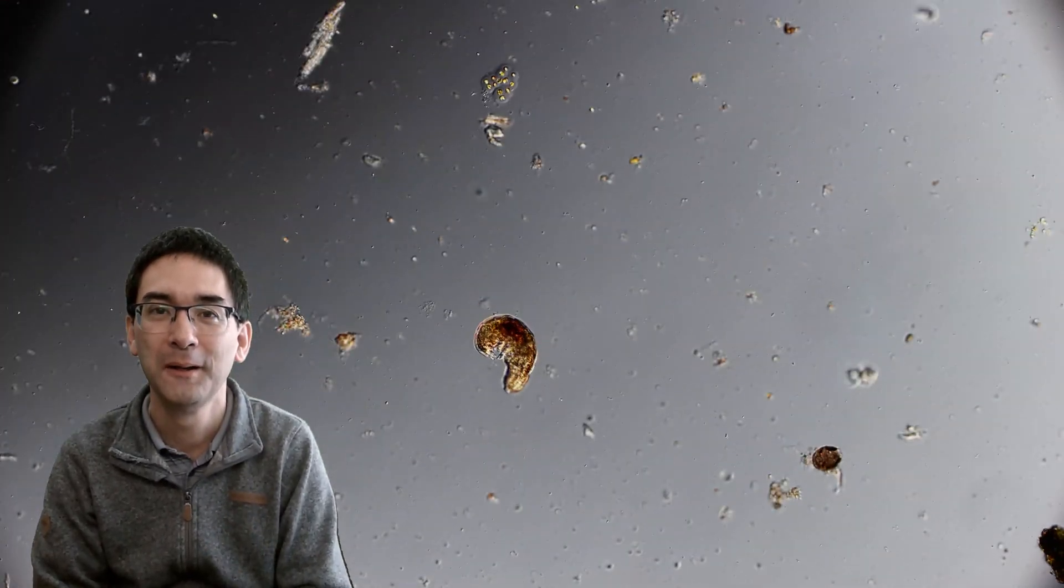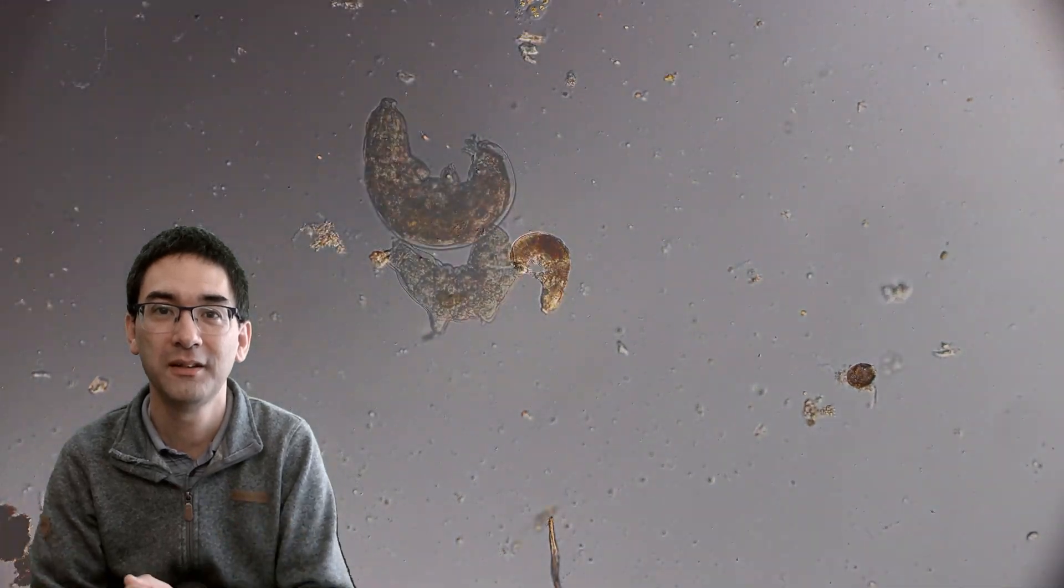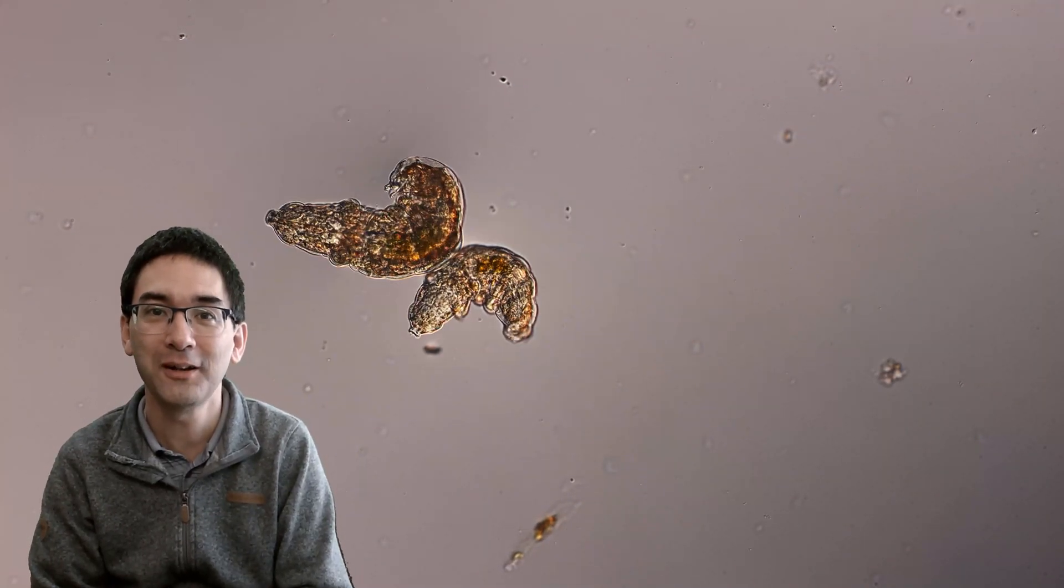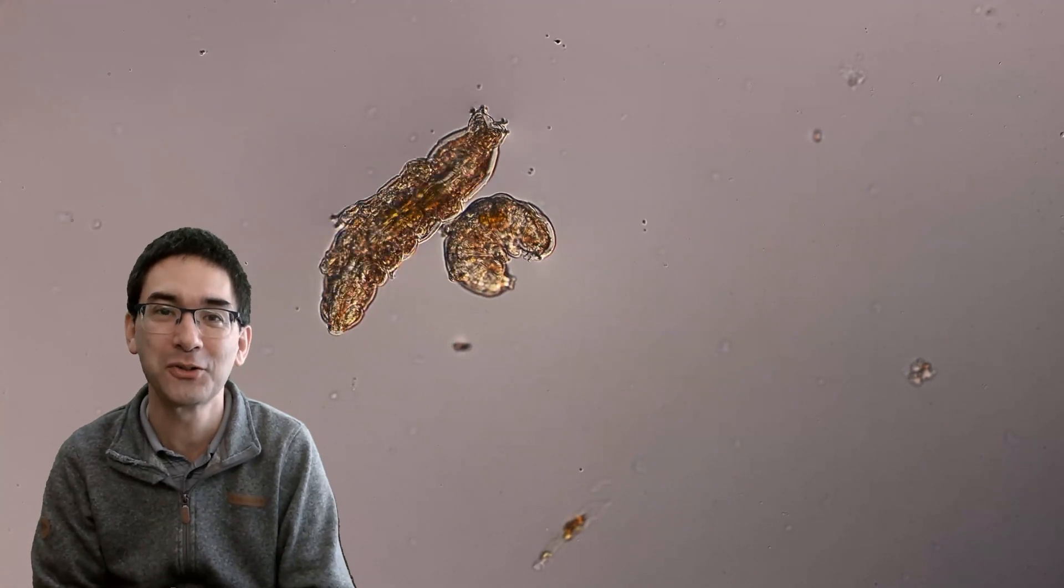Yeah, it's time-lapse, by the way. Yeah, because you see, and here is another one. Of course, I had to look a little bit closer. I found two of them next to each other. Also quite nice.